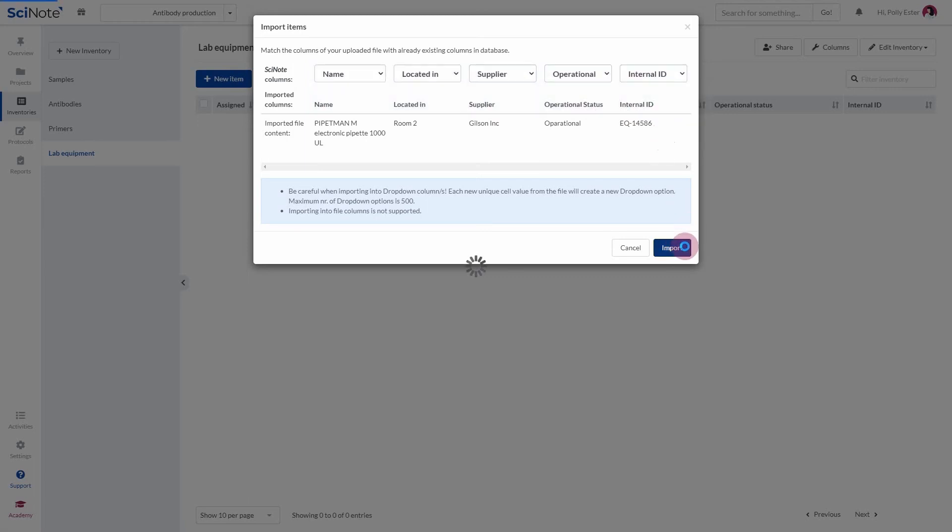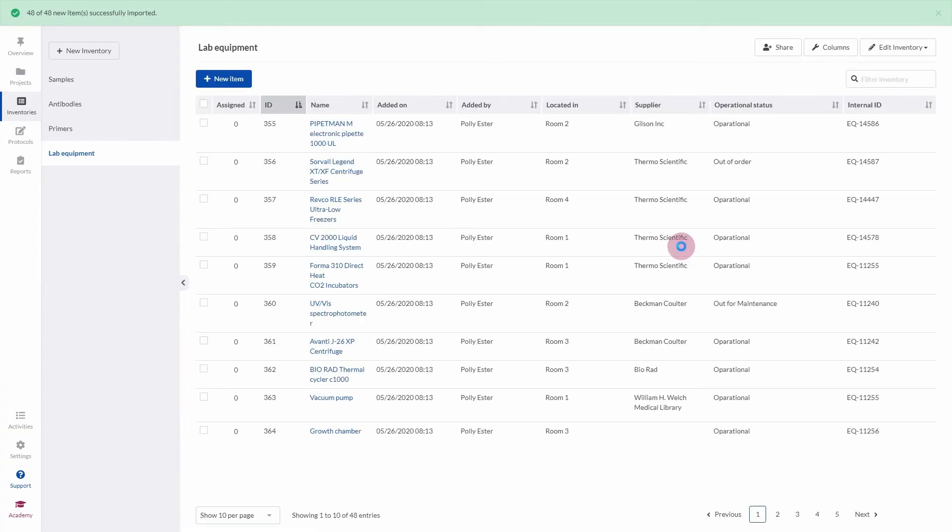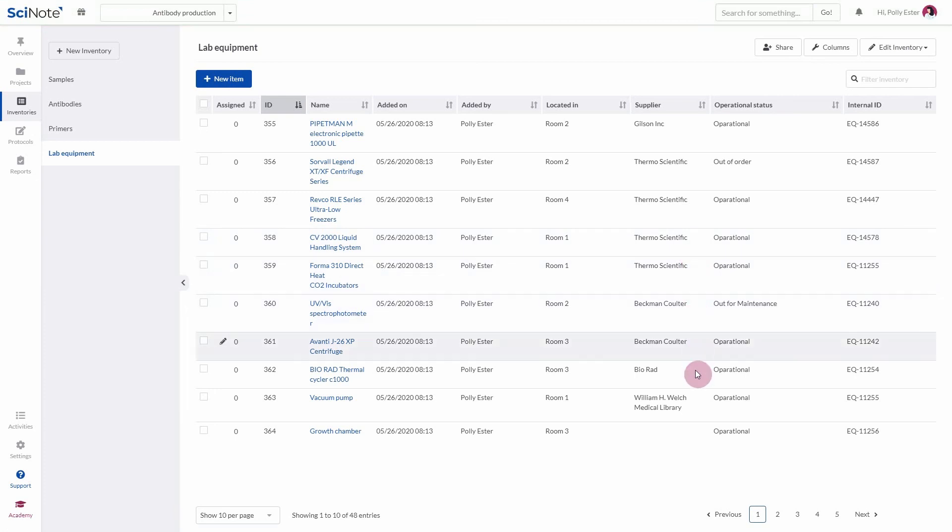Please note that it is possible to upload 2000 items at once from a file, so if you have a very large database of items you would like to upload, please split it into parts accordingly.